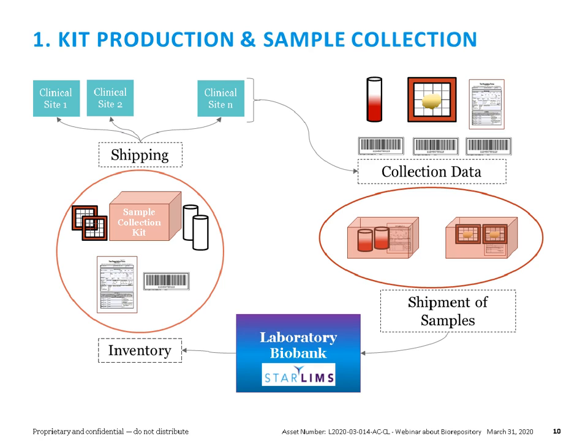And so all of these inventory data, the LIMS should be able to track, not only for purposes of tracking your consumables and your production of your kits, but also when you need then to ship those kits to the different clinical sites. So in this case, for instance, once you have prepared them, you have them in inventory for your kits, you can then use a transaction from inventory solution such as shipping to indicate the destinations for the different kits.